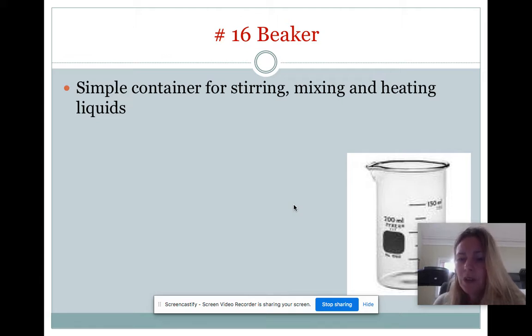So the numbers here are just representative of what you can use when you're grabbing a beaker from the science lab. The truth is we wind up giving you beakers. You usually don't have to select, so it's kind of done for you. You don't really think about it too much. But in science lab, you need to know how much liquid you're going to need to hold in your particular beaker. So that's what the numbers are there for, not for measuring. And it also tells you if you did a good job of measuring. If you said you grabbed 100 milliliters and it's overflowing, you did the wrong thing. So it's just there for a check.